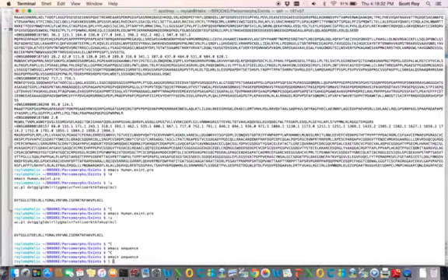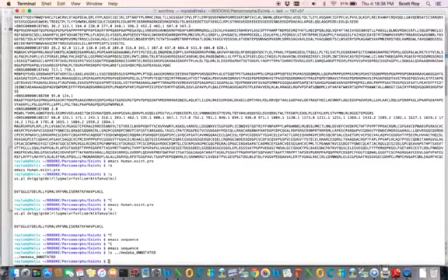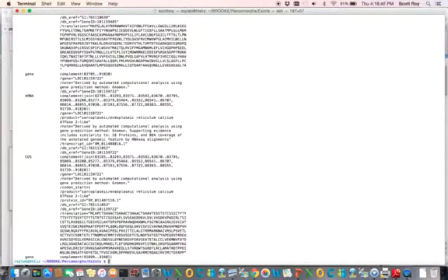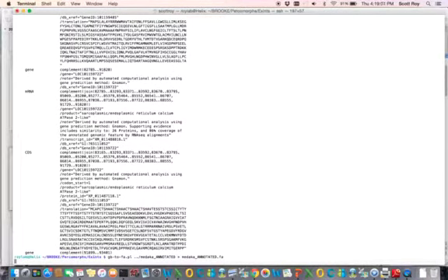So we can just start by doing this with Medaka. No better reason than it's one of the three. So this is where the Medaka genome is, but remember that it's not in FASTA format, it's in GenBank format. So you can actually use a script called gb to fa.perl on the Medaka GenBank file, and that will create a Medaka FASTA file.